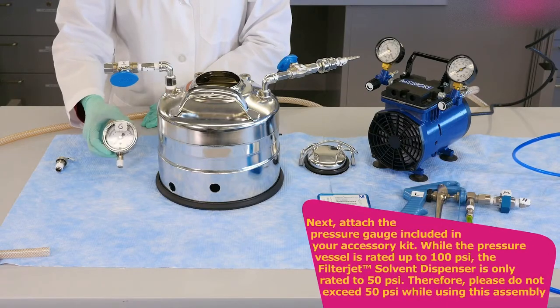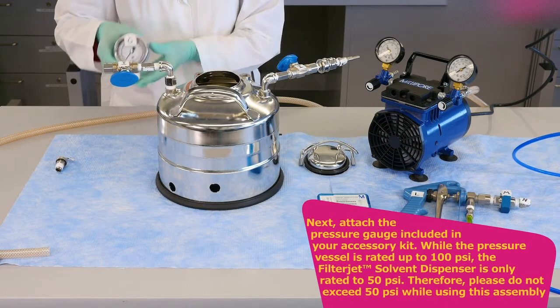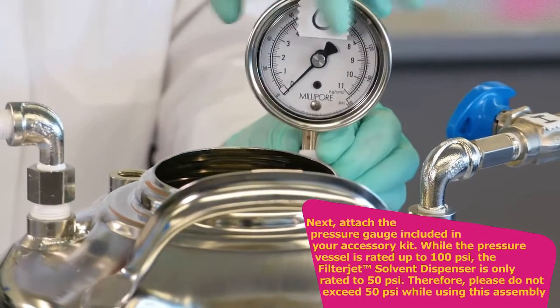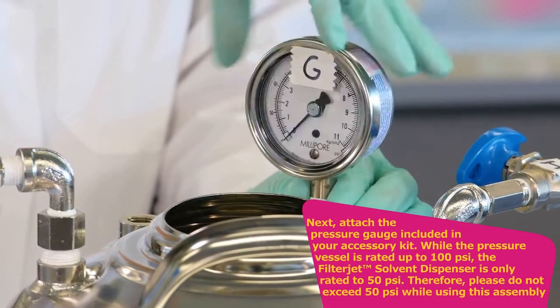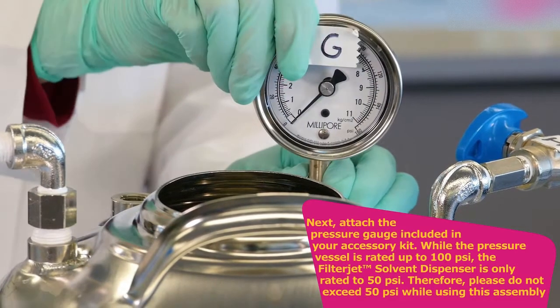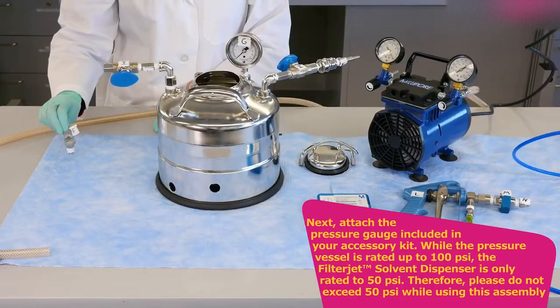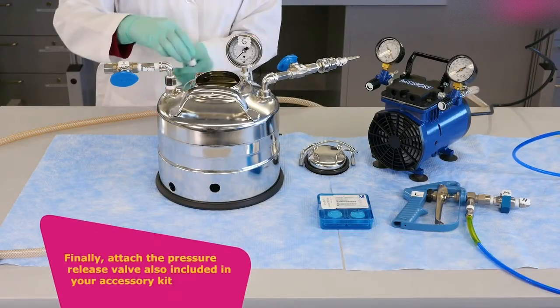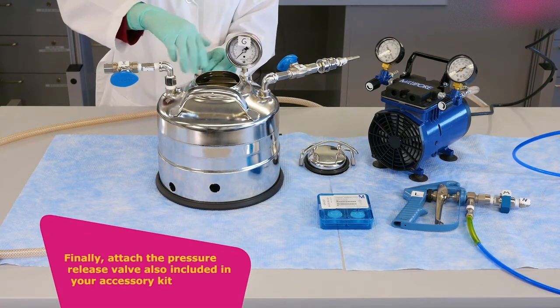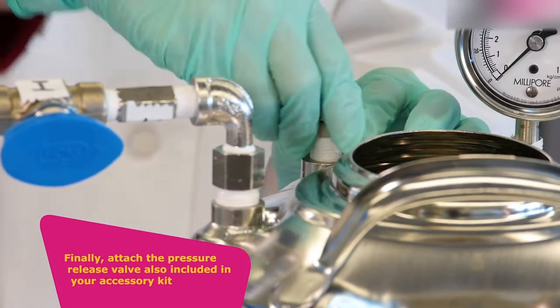Next, attach the pressure gauge included in your accessory kit. While the pressure vessel is rated up to 100 psi, the filter jet is only rated to 50 psi. Therefore, please do not exceed 50 psi while using this assembly. Finally, attach the pressure release valve also included in your accessory kit as shown previously.